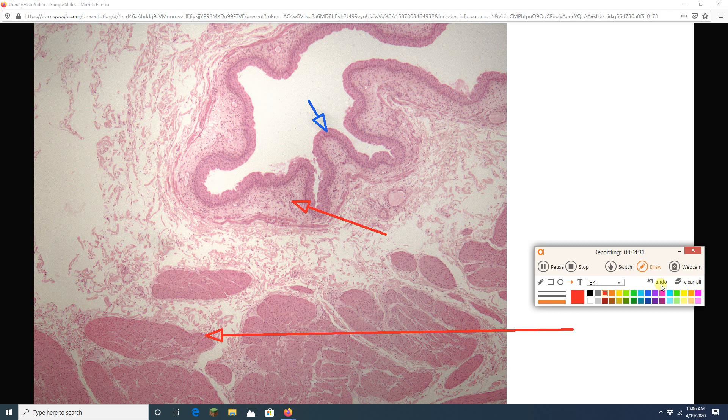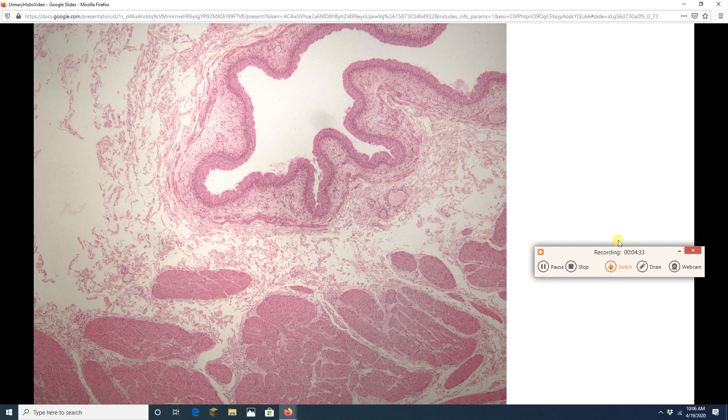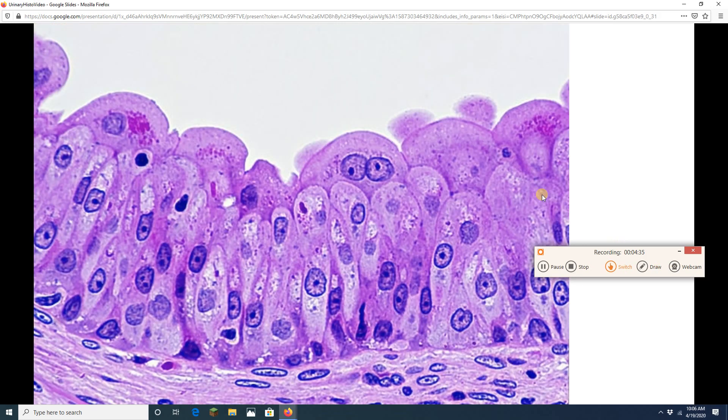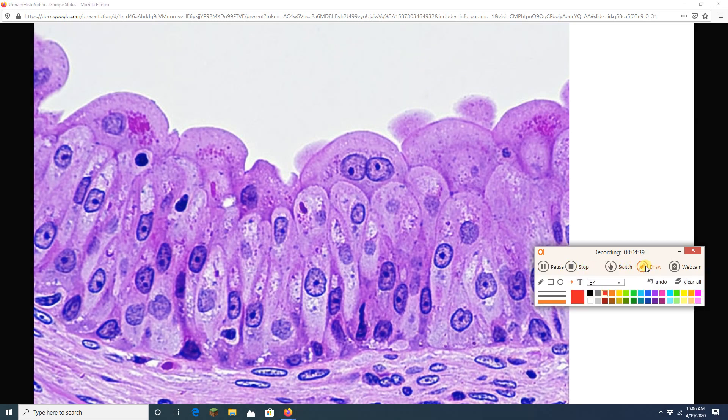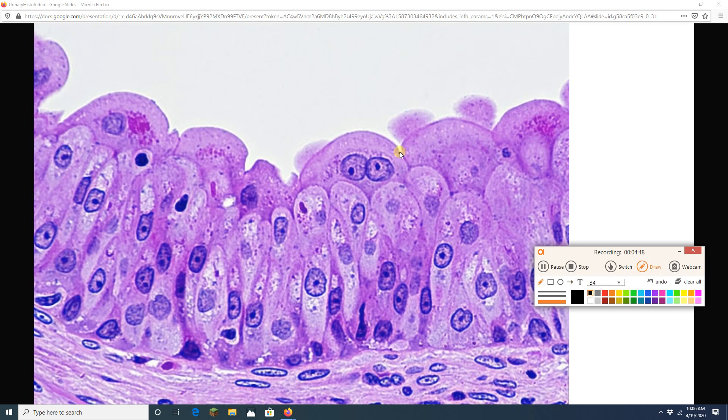Okay. Zooming in on the epithelium here. This is transitional epithelium. When we zoom in we are going to see the characteristic dome shaped cells are called umbrella cells because they kind of look like an umbrella.